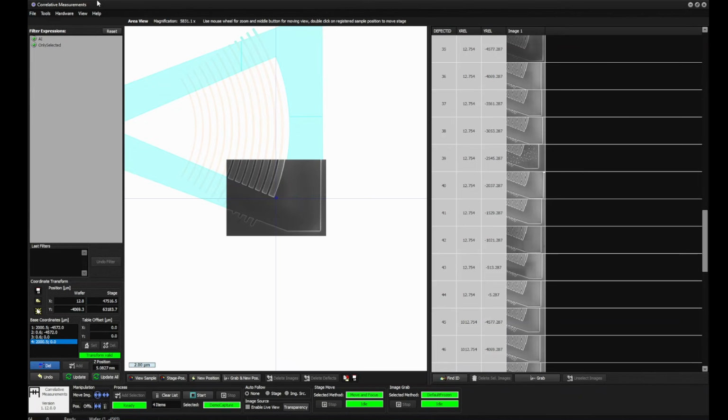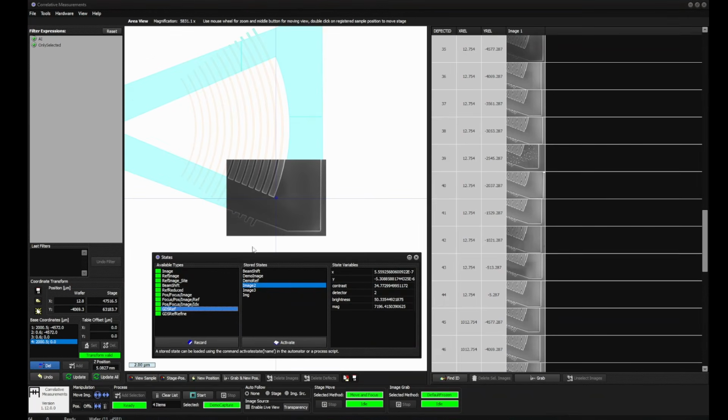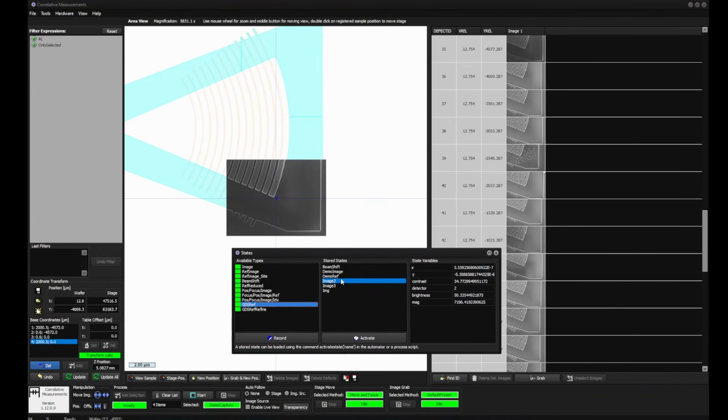So to activate another magnification step, we go to the state system again. And you remember the first ref state was this here. And there's now another state type which can be used for refining. This doesn't delete the beam shift, which the other one does at the beginning. So we create another one with a current magnification and then call this demo ref 2.